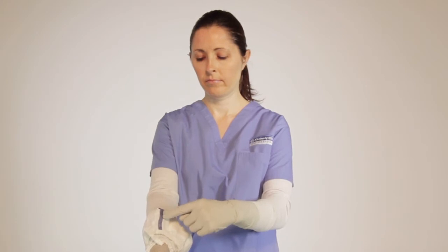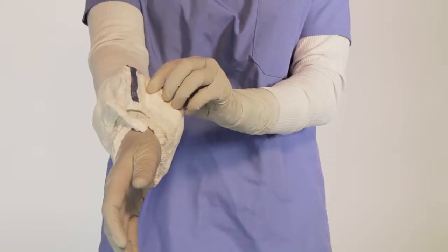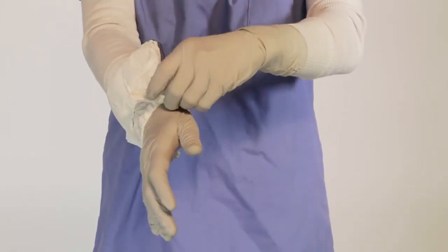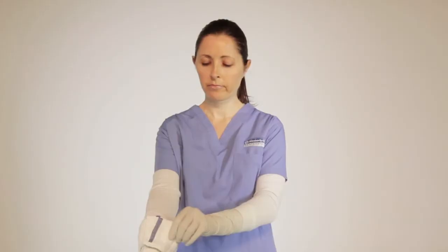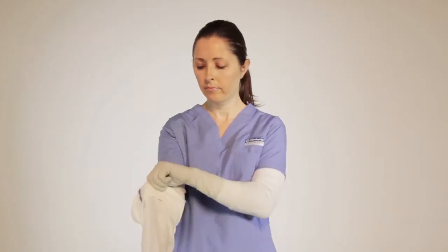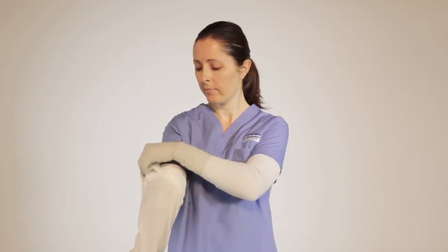Locate the blue line. Position the opening to align the thumb loop to the thumb. Place the thumb loop over the thumb. Touching the side with the blue line, pull the sleeve up the arm to the bicep.